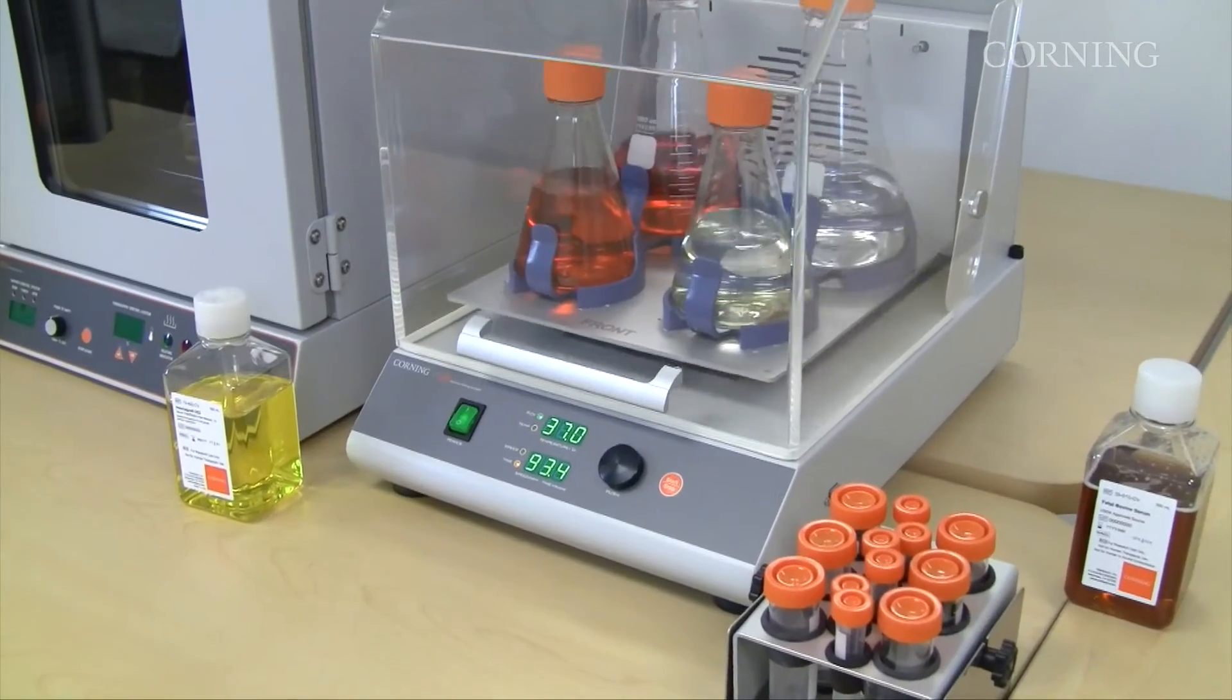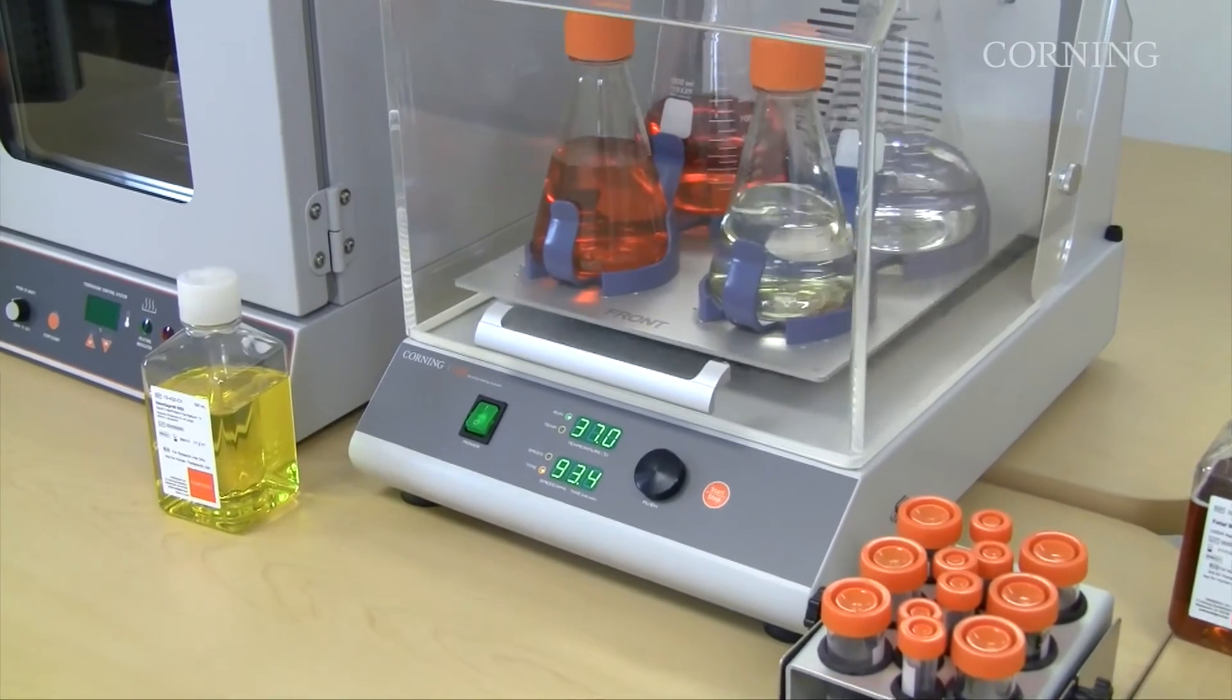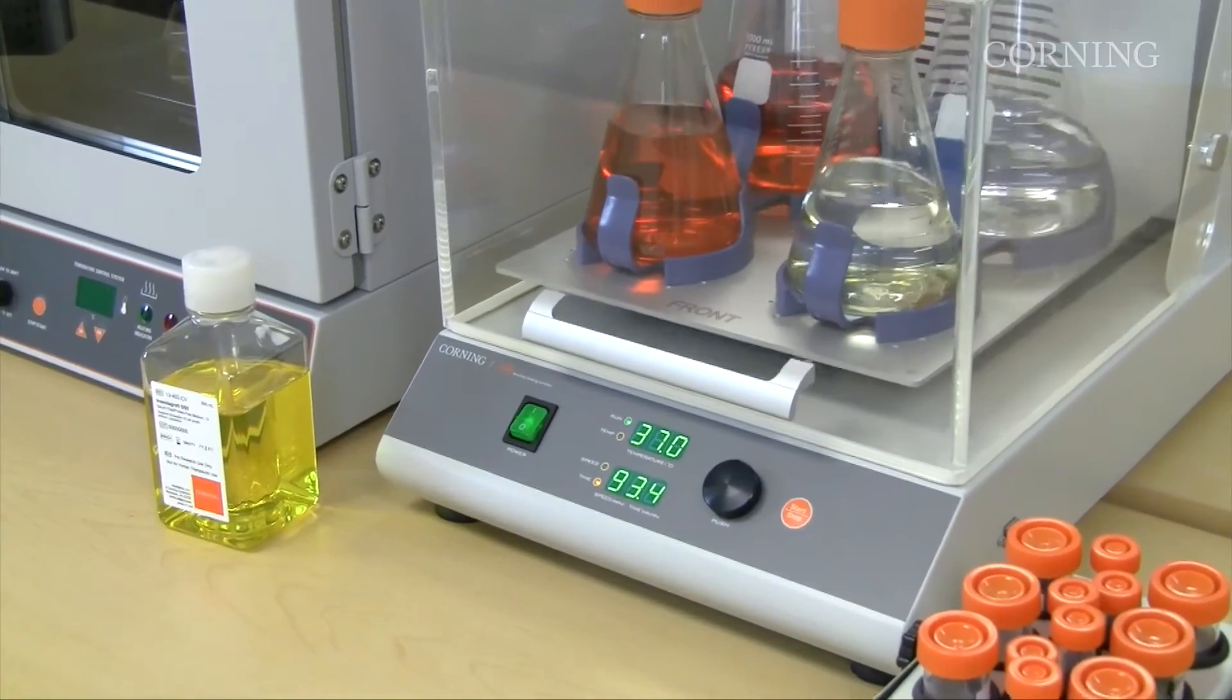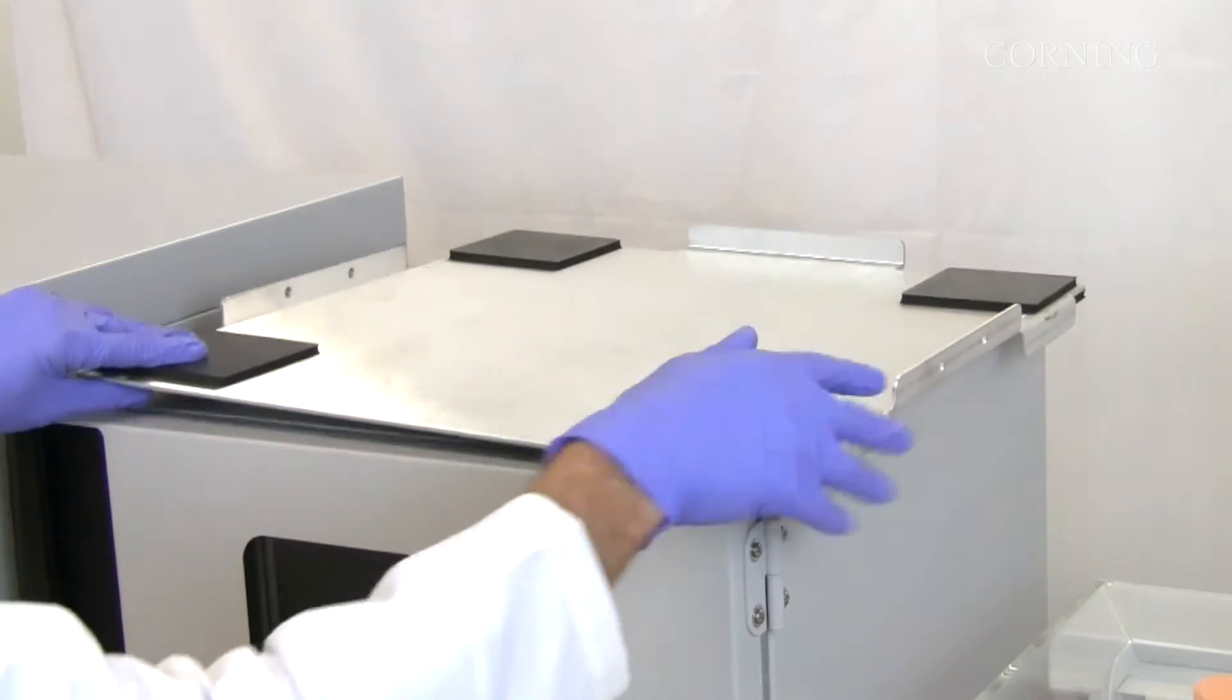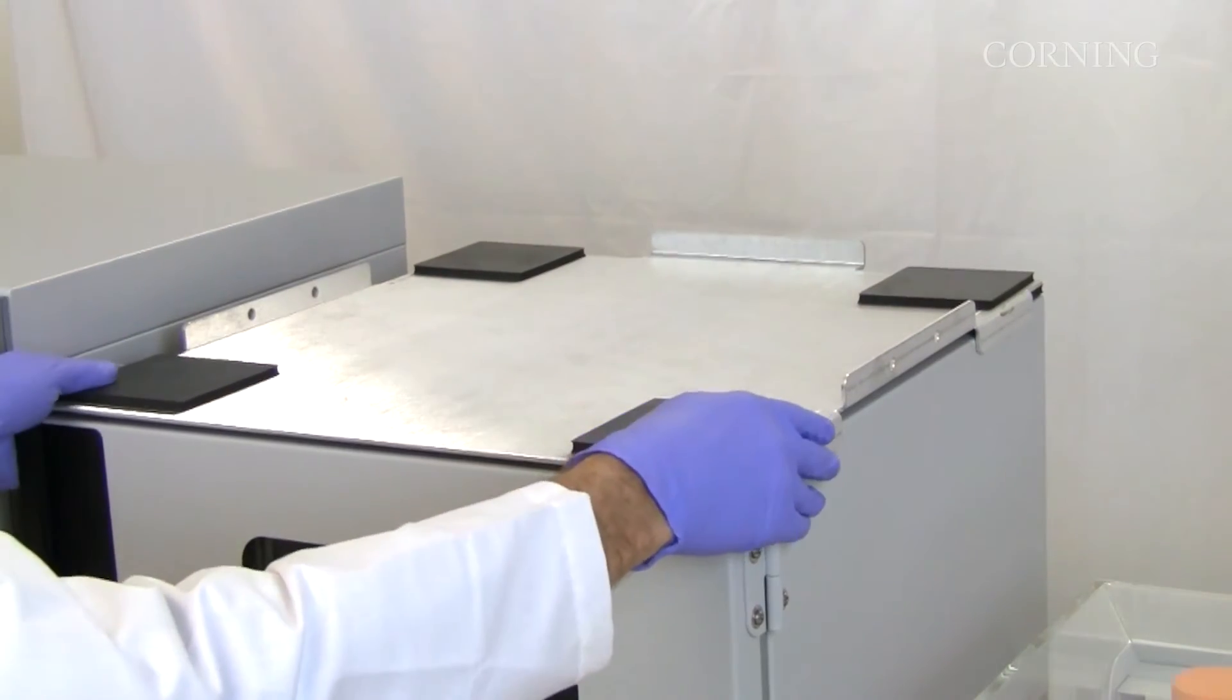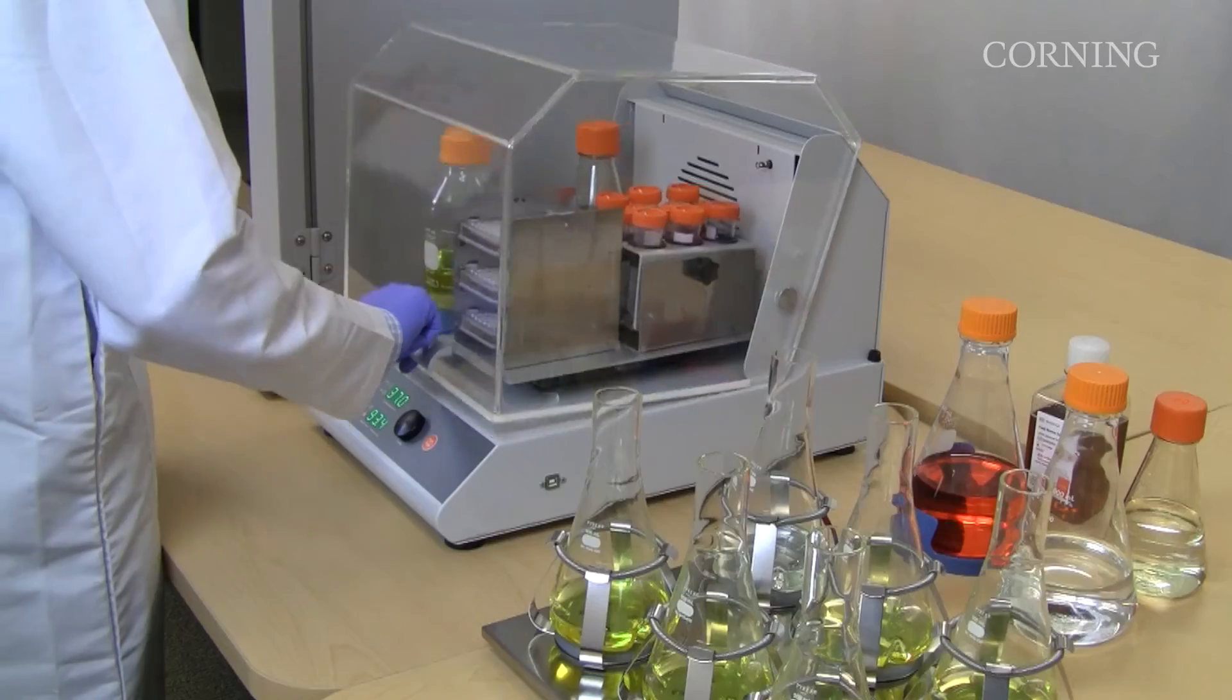The orbital shakers are designed with a compact footprint to maximize laboratory space. If you have multiple incubators, you can use the adapter to stack them and save additional lab space.